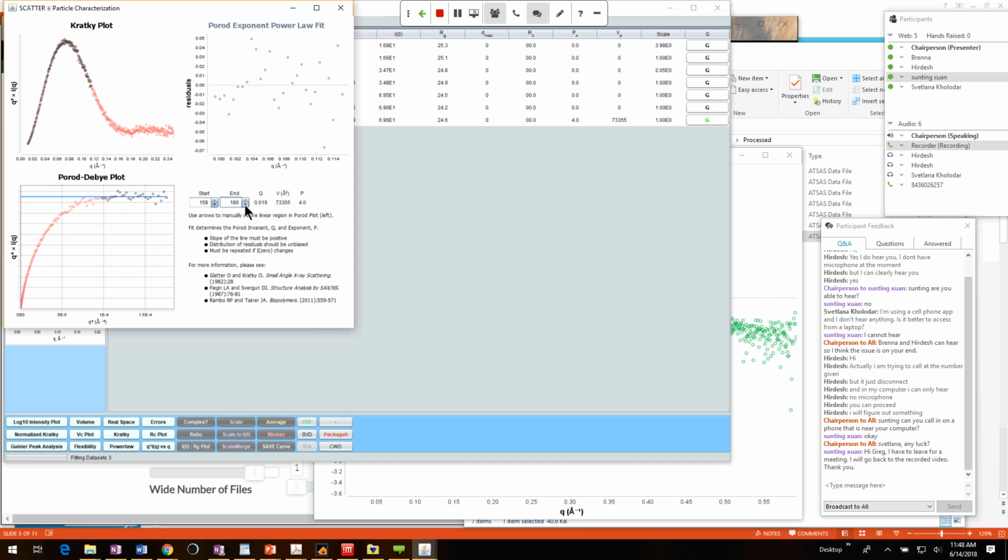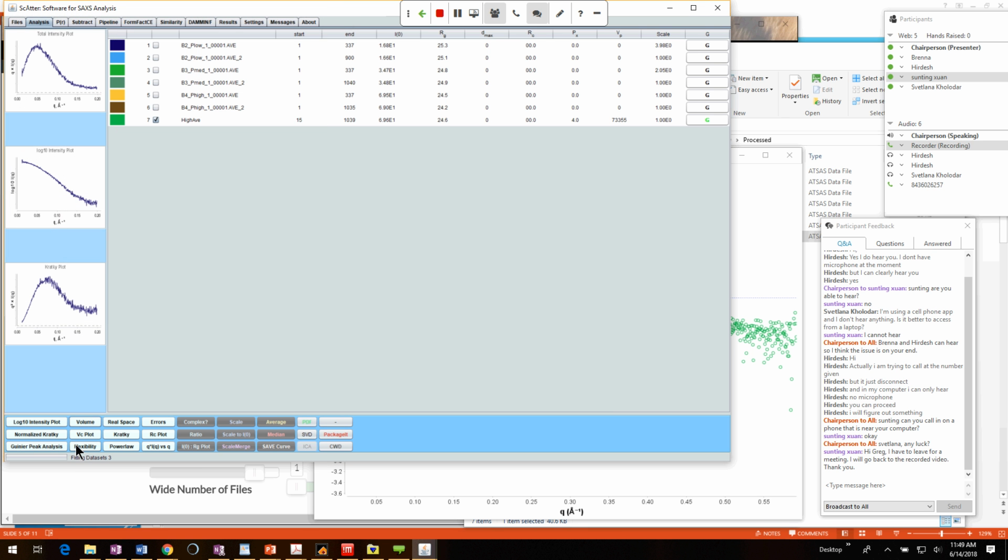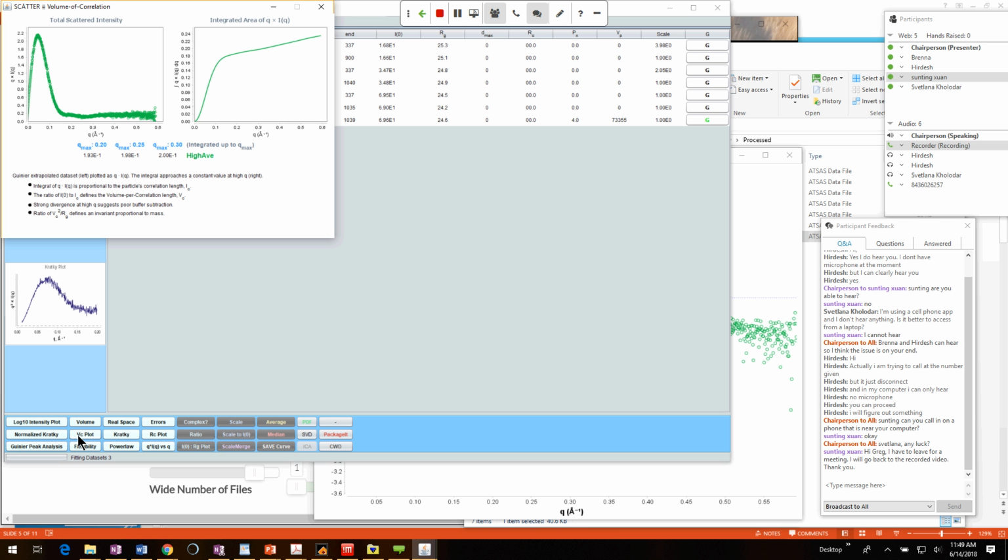So that gives me now an Rg and a volume, and whether it's globular or not, or flexible or not. Combining those three pieces of information, I can now calculate the mass of the particle. So I'll close that out. I'll hit this Volume of Correlation plot, which does that calculation for me. It takes in the Rg, the exponential decay, and the volume. It does a calculation. I have to click it for it to work.